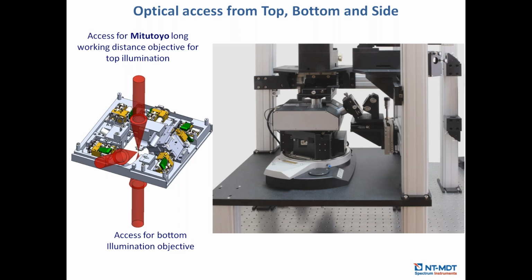Okay, this is about AFM probes. Contact mode produces the longest contact time and the strongest enhancement. But if you scan in contact mode, you can easily scratch away your sample, or damage the TERS active coating from the tip apex.